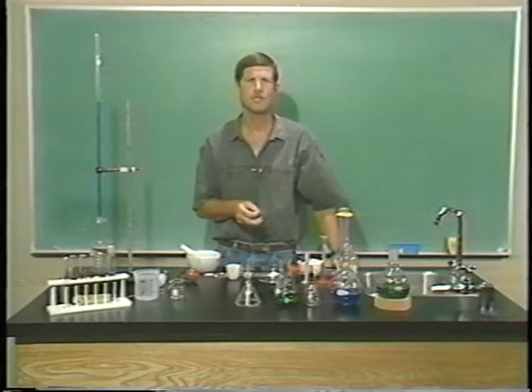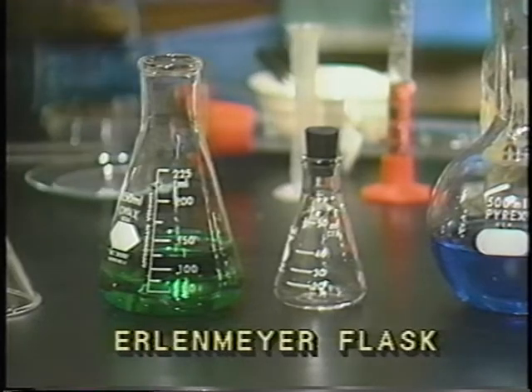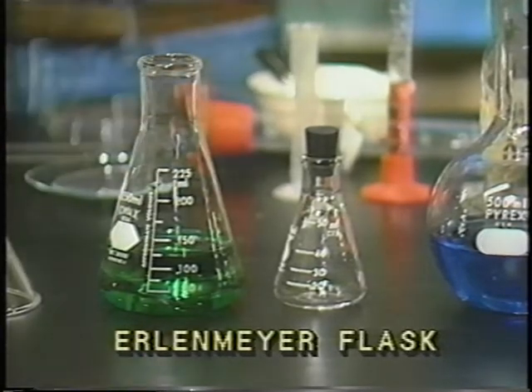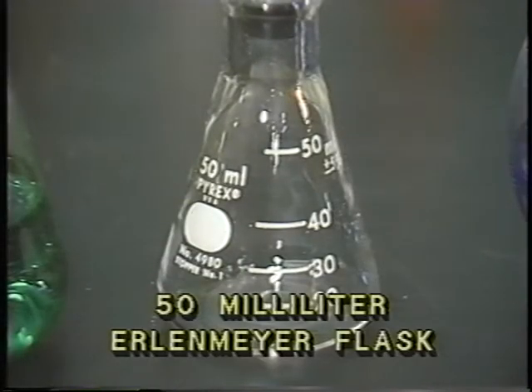Then we have three different types of flasks. Try and remember the names of these. This first one is called an Erlenmeyer flask. It has a triangular shape. That's how we remember it. And this one holds 250 milliliters. Next to it, we have a much smaller baby Erlenmeyer flask, which only holds 50 milliliters of liquid.